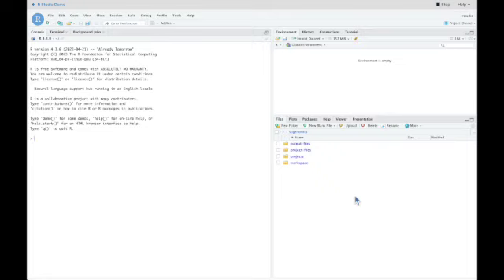Some additional options have now appeared. So all of the files in your CGC project will be located in project files. This is read-only, however. So when saving your files, you'll be saving to output files. So first I'll click on Project Files, and you'll see my breast cancer dataset.